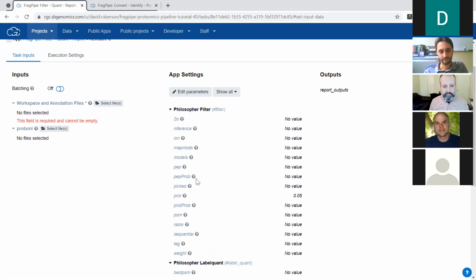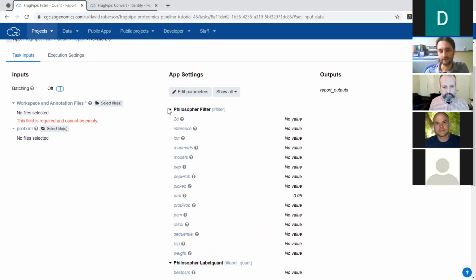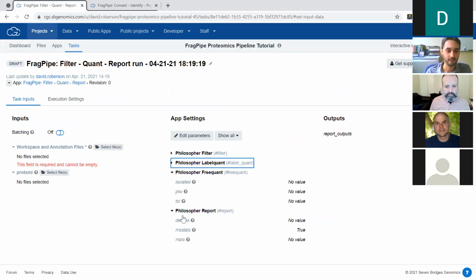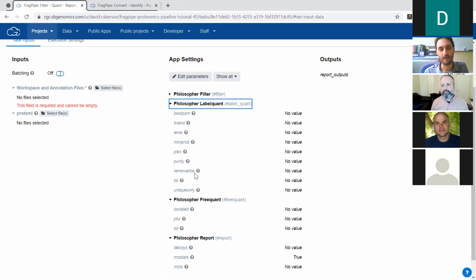They're quite a lot. Yeah, usually these proteomics pipelines have a lot of parameters that you can tweak. So here what you're showing is all the different false discovery rate thresholds that you can apply during the filtering, because what Philosopher does is it takes all the peptides and proteins and divides them into layers, or levels.